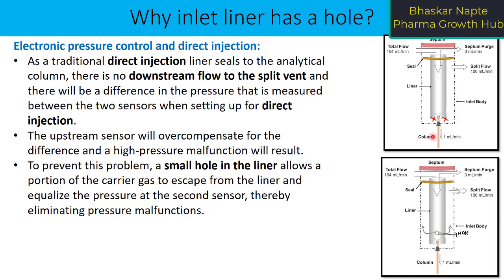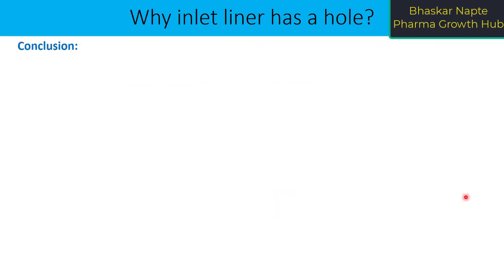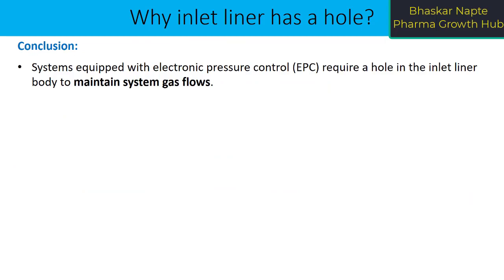Now to prevent this problem, a small hole in the liner allows a portion of the carrier gas to escape from the liner and equalize the pressure at the second sensor, thereby eliminating pressure malfunction. You can see in the second diagram at the bottom there is a small hole in the liner. This small hole allows a portion of the carrier gas along with the sample to escape from the liner and equalize the pressure at the second sensor, thereby eliminating pressure malfunction. So the conclusion is: systems equipped with electronic pressure control or EPC require a hole in the inlet liner body to maintain the system gas flow, especially when using direct injection.